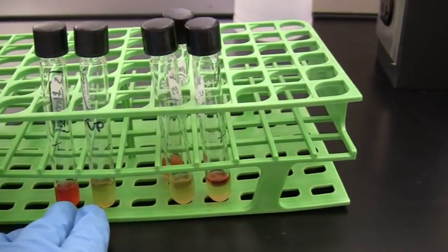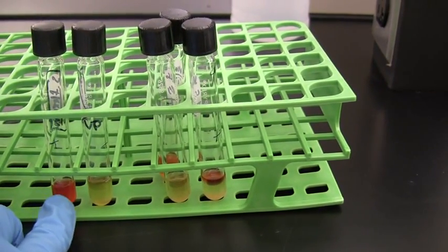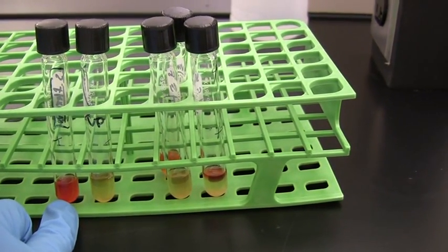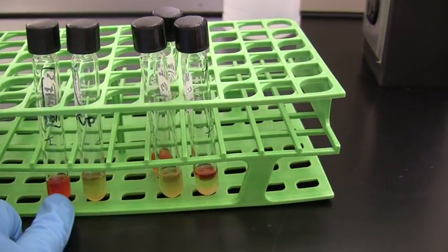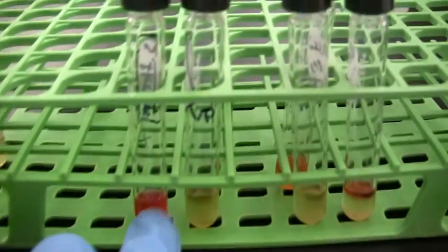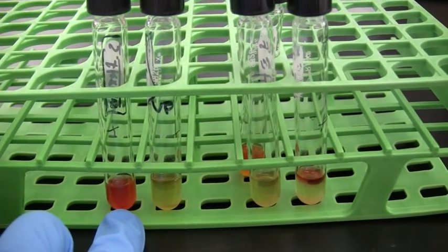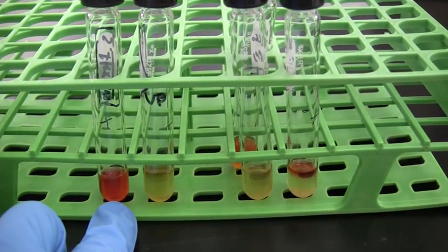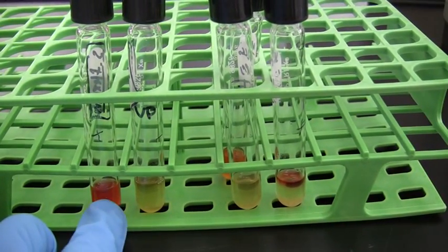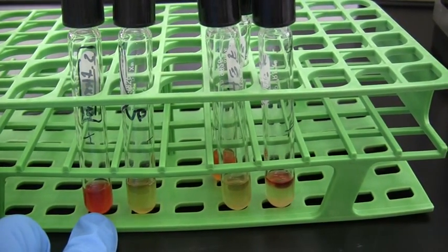This is a medium that's split into two tubes. So you put the same species of bacterium into both tubes, incubate, and then you add the reagents. Here on the left we have methyl red reagent that's been added. And the test result of it staying a bright red indicates that it is positive for the production of mixed acid, so the pH has dropped.